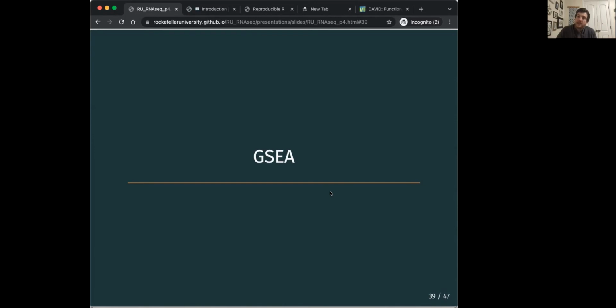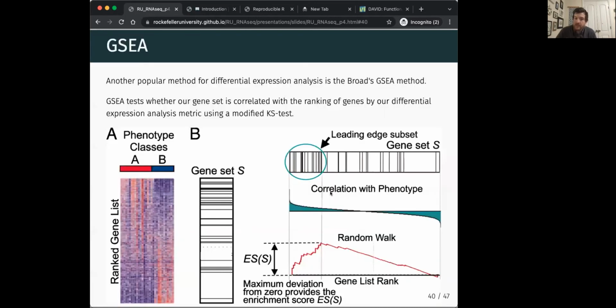GSEA is much more complicated than that, but the nice thing about it is it allows you to leverage your whole data set. So doing a gene set analysis, the previous set relies on you having a cutoff, a threshold of some kind. So in that case, we're using an adjusted p-value of 0.05. But there could be lots of useful gene set information at 0.06, right? There could be extra things there that may have, like, pushed it over if we did it for whatever value, for whatever reason we were considering 0.06. Or maybe a more significant, more stringent threshold would have been more useful.